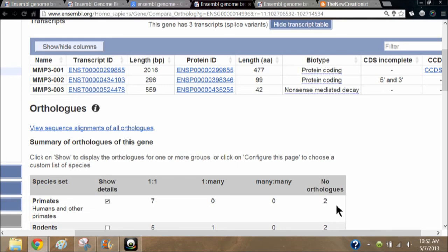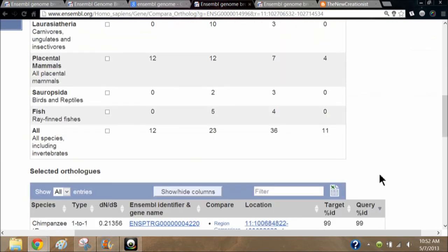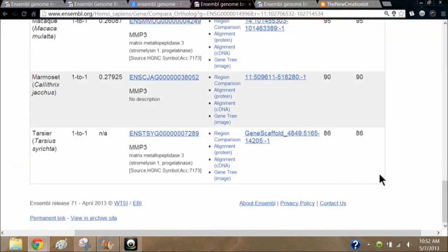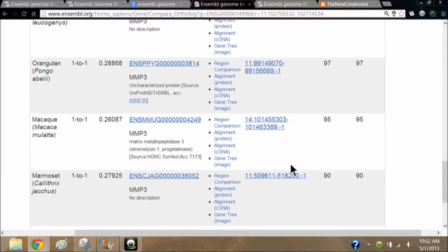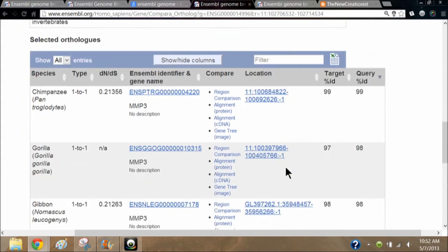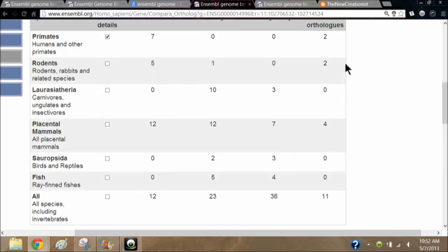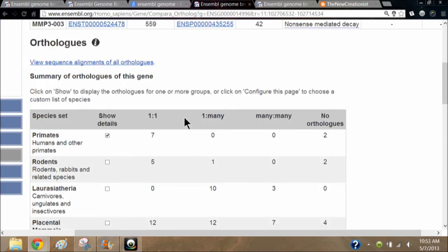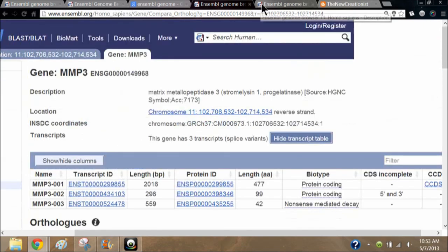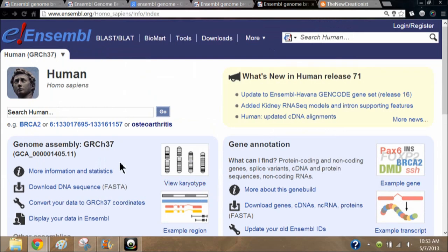Of course, two primates without the gene at all would be a major discrepancy. If upon verifying we actually found that this gene does not appear in bush baby or mouse lemur, then we'd have a problem. I do believe this probably is a problem, because there are so many problems accumulating.